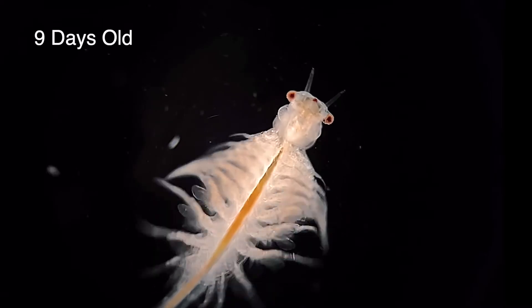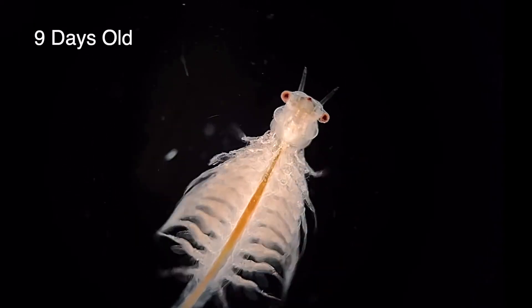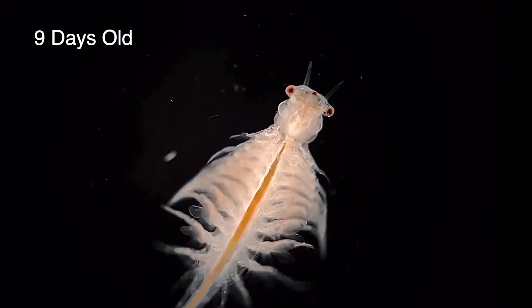Here we are now at the teenage stage. Their legs are fully formed and they resemble a smaller version of the adults. From here the development of males and females diverge as they begin to undergo sexual differentiation.